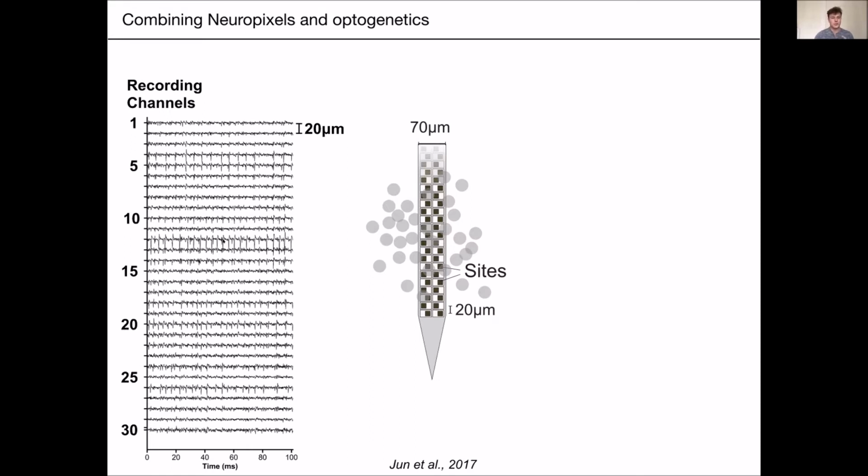And you very quickly realize one of the great frustrations of electrophysiologists, especially when working in an imaging lab, which is that you are blind. You do not actually see your neurons. You do not have any information about the morphology or the genotype of the cells you're recording. This cell here might very well be a big projection neuron in your system or a local interneuron. There is no way to know like that, but there are ways around it.